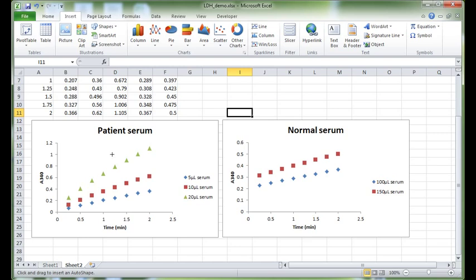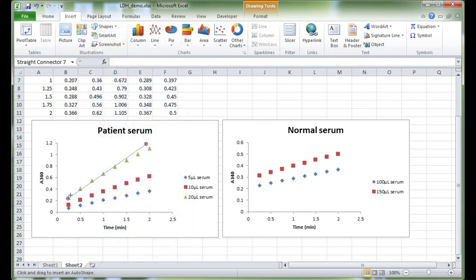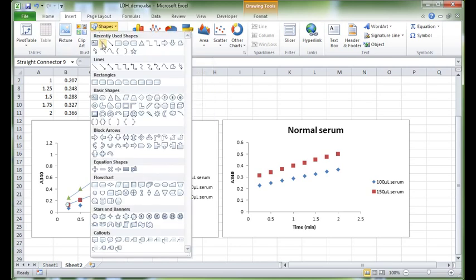So when we click and drag a new line manually, I'll click this and drag it along here, and what we can see is that the absorbance is not increasing linearly over time. And if I draw two other lines just to satisfy our curiosity, I'll draw one of these lines for the red series, and I'll draw another line for the blue series.